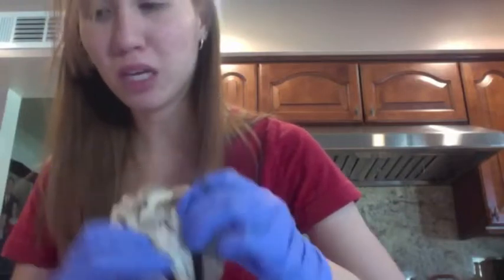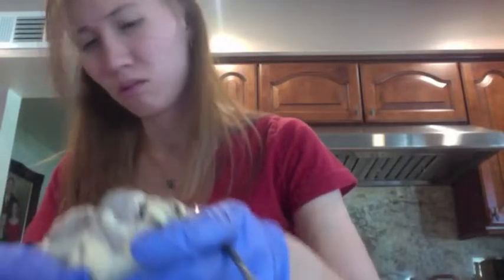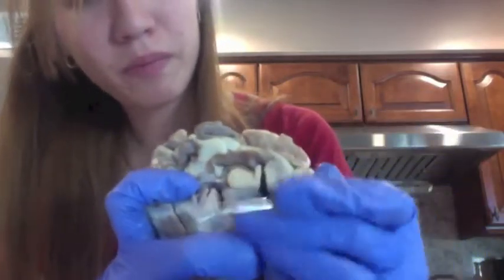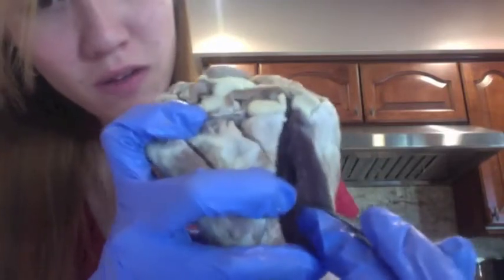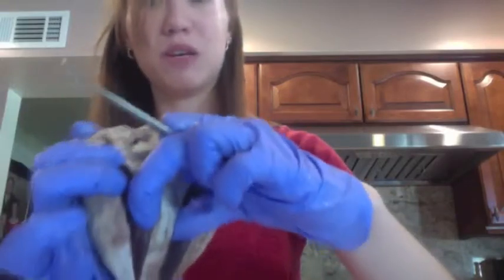We have the trabeculae carneae. I'm trying to find a good one. I think it's going to be in here. The trabeculae carneae is all of the unevenness kind of right down here on the inside of the ventricle. Then we have the interventricular septum, which is pretty much this meaty part right here.